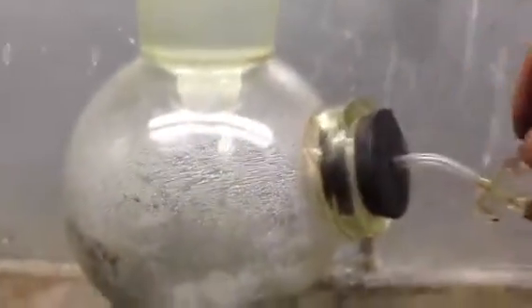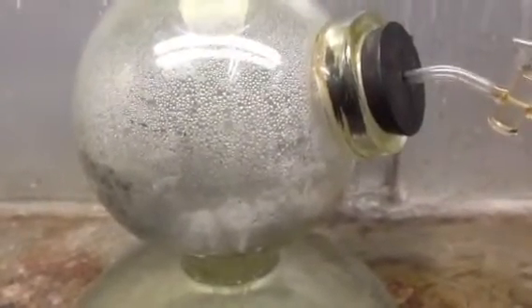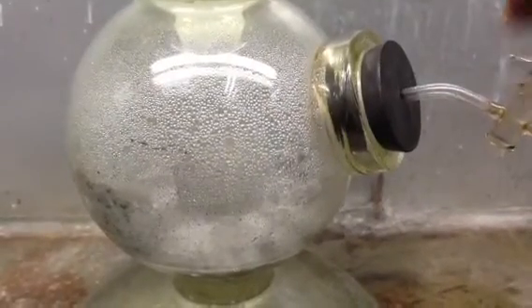I figured I'd show you. If I open this valve here, you can see the solution rises, bubbling away. I'll open the valve more. Now you can see it comes into contact with the medium. So right now it's producing carbon dioxide gas and it bubbles off into wherever you need it.